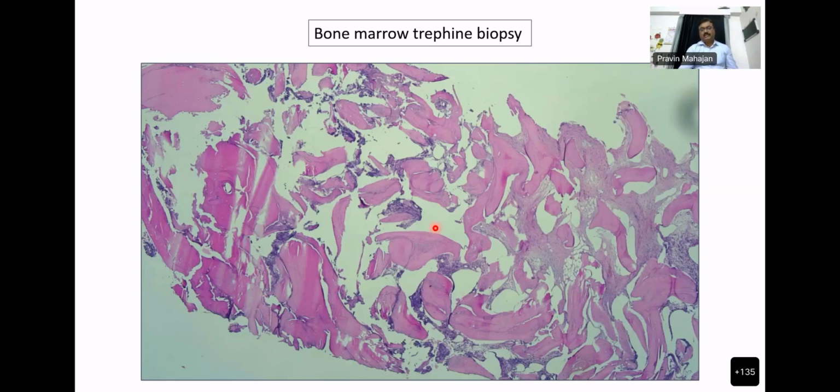So you have to tell them that if it happens again and again, you have to go back and tell your clinical colleagues that this is what is happening. You may have to use good needles, and also stop aspirating from the same site. When they are aspirating from the same site, this kind of artifact is produced. They have to change the direction of the needle when they are taking the biopsy after the aspiration.